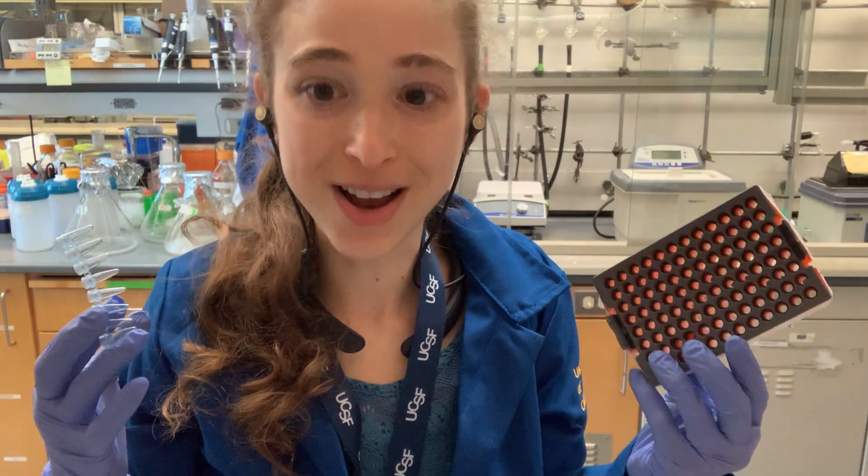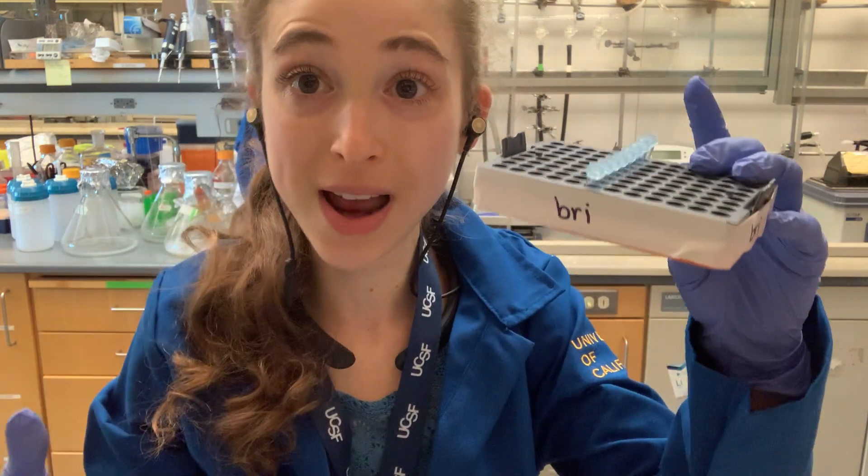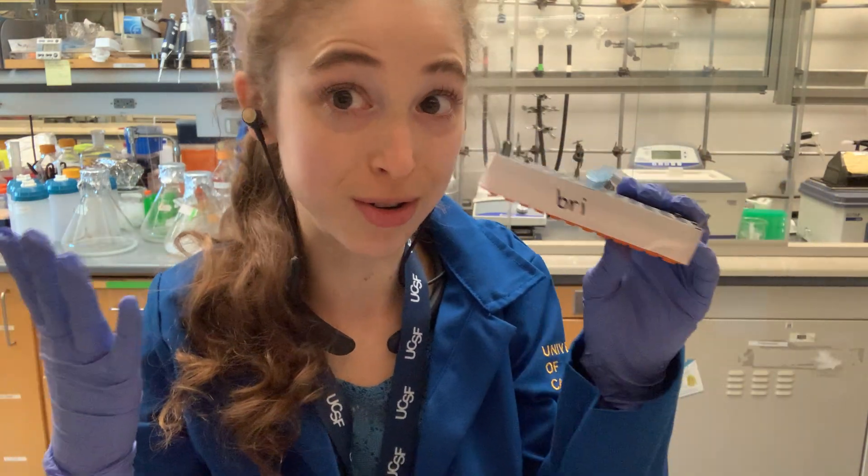Yesterday I reached an important milestone in my postdoc — I went through enough pipette tips to make a PCR strip tube rack. Here's a quick post for those who don't know this lab hack.